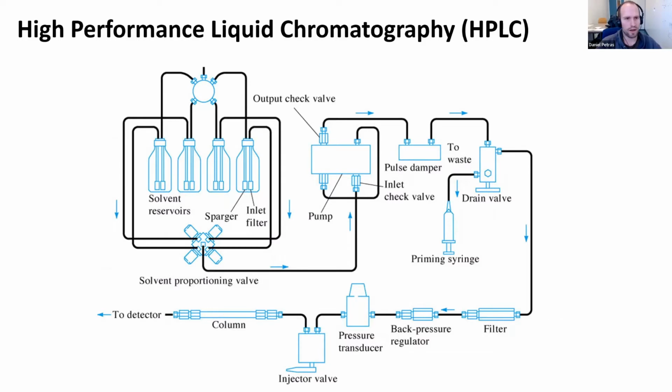So a UHPLC system, or in this case, HPLC system, so high performance liquid chromatography, typically consists of solvent reservoirs.